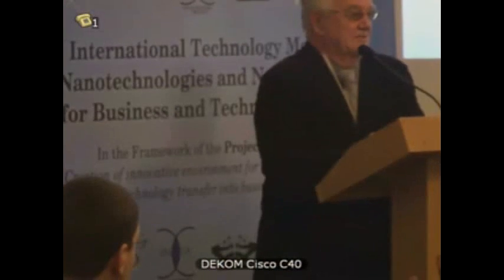Why not? 50,000 sounds quite realistic, if only you have at least one detector. And the detector comes with a size 14 by 14 millimeters with a 50 micron step between them. So you have to describe a profile of X-ray radiation.